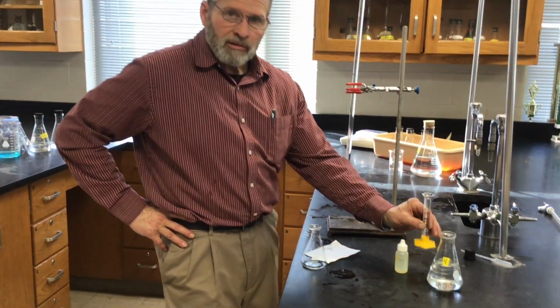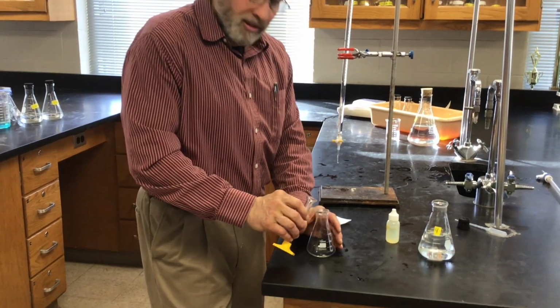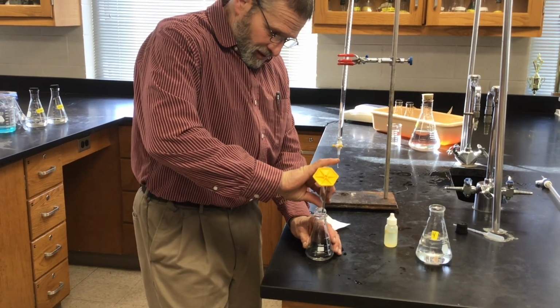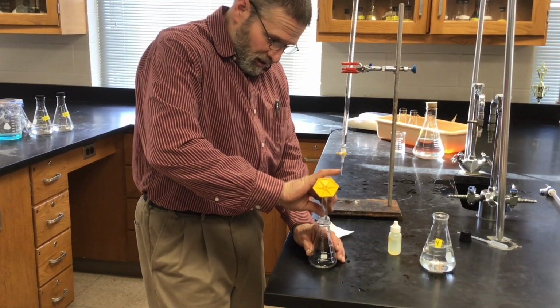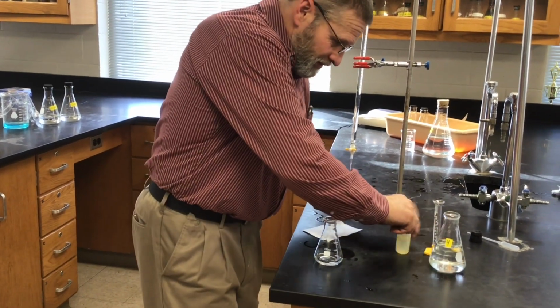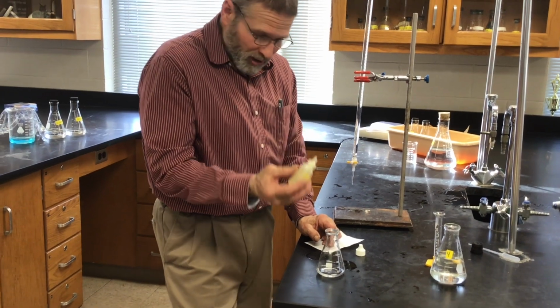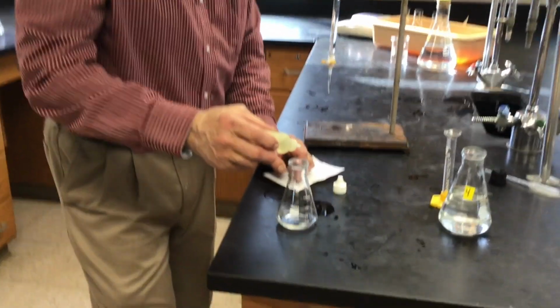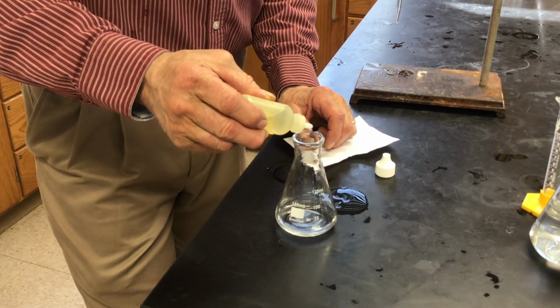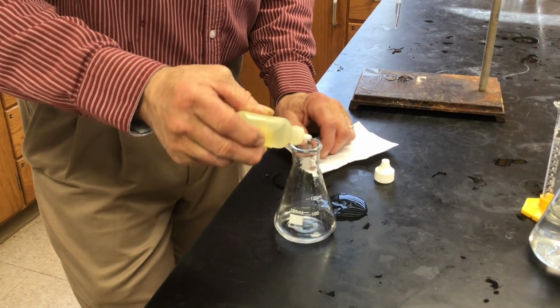Mr. Moore's measured out 10.0 milliliters of the Ag2X saturated solution. Mr. Moore does most of this, to be honest with you. Okay, after years of careful study, we figured out 6 drops is the magic number of indicator. 1, 2, 3, 4, 5, 6.